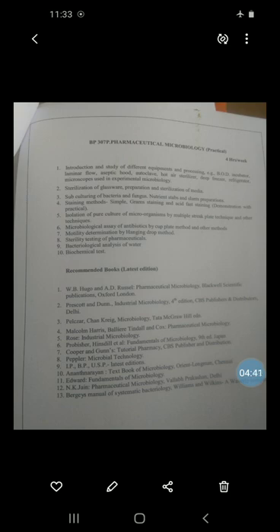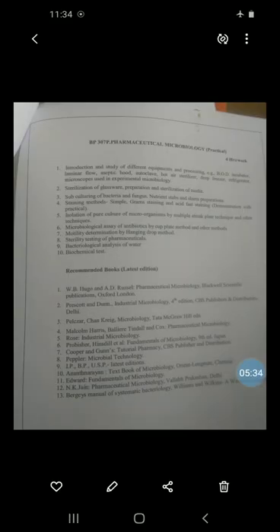Disadvantages of this technique. The microbes are uniformly spread in liquid agar, therefore they are also present below the surface. Hence, surface and subsurface colonies are developed, and it is very difficult to transfer the colonies into fresh media. Second disadvantage, those microbes which are sensitive to higher temperature cannot be isolated by pour plate technique, because the temperature of agar should always be high to maintain liquid consistency. Hence, pour plate method is unsuitable for isolation of psychrophilic microorganisms.